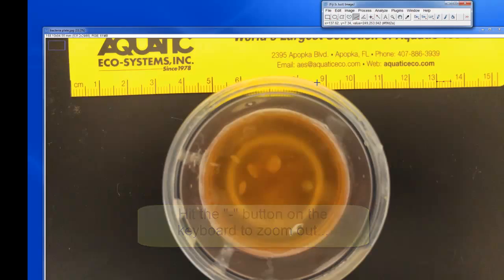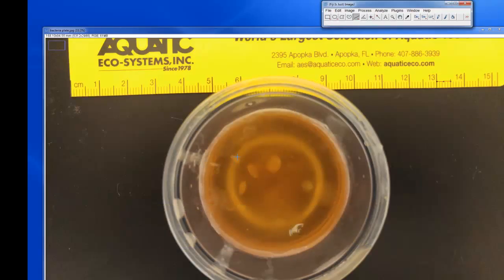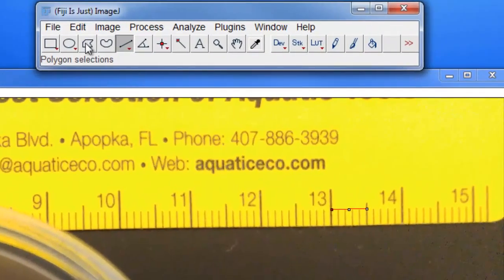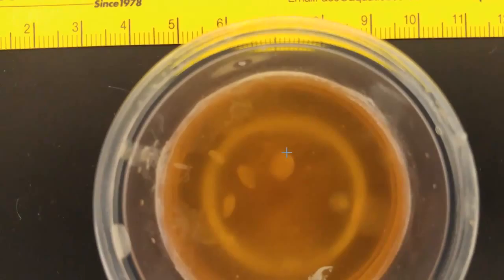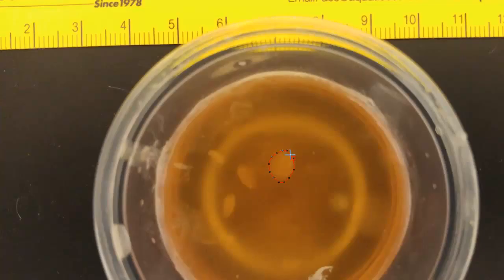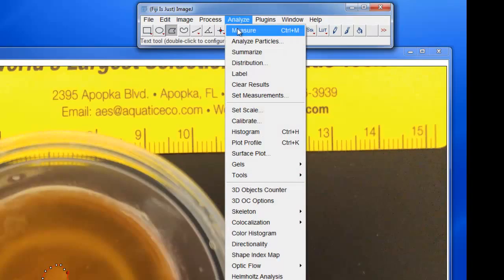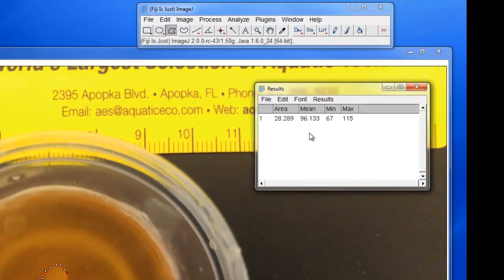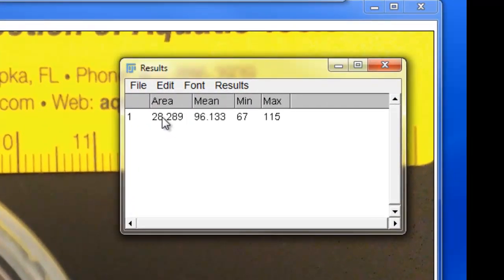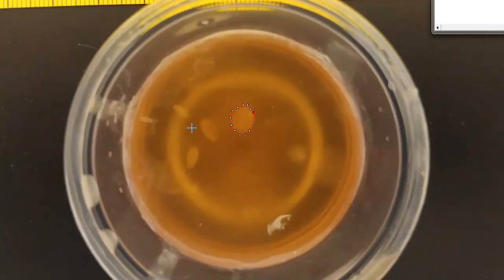Now all we need to do is measure the area of each colony. I'm going to use the polygon tool — I'll choose that and slowly click around the edge of a colony, being as careful as I can. When I get all the way back to my starting point I double-click, and there's the polygon. If I go to Analyze > Measure, the results window shows an area of 28 — and because I calibrated with the ruler, we know that's 28 square millimeters.